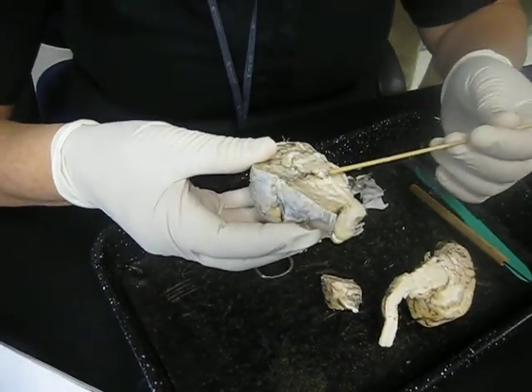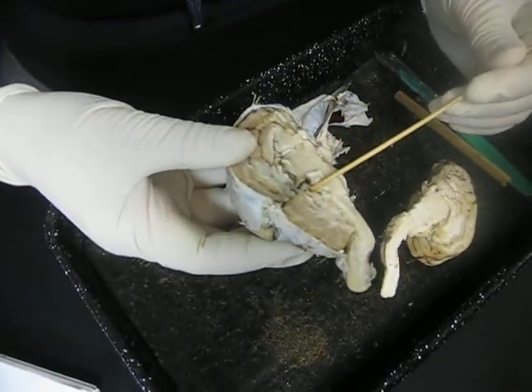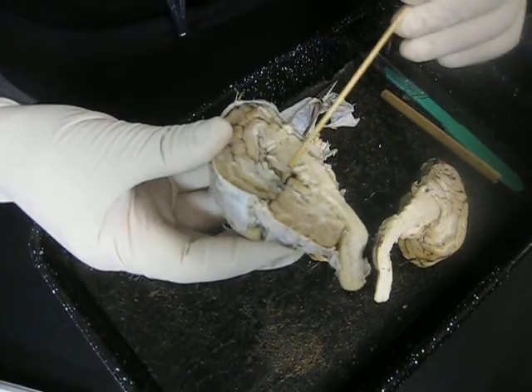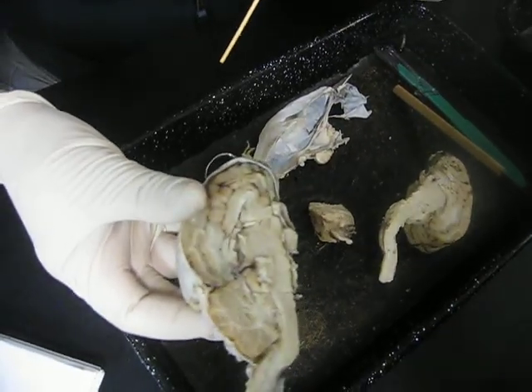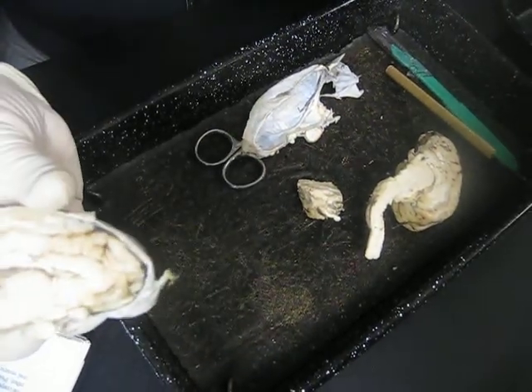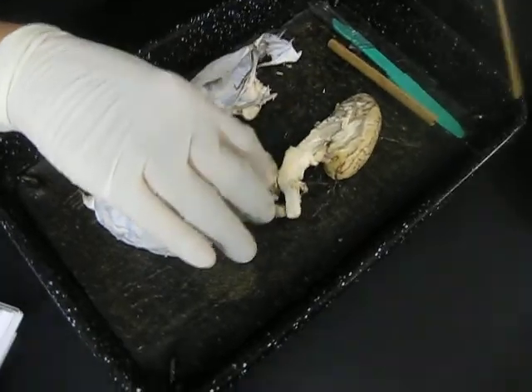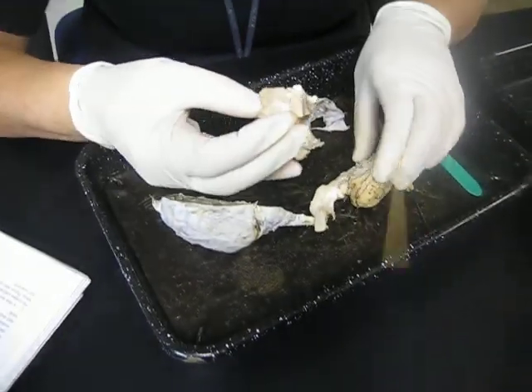I don't think so. Okay. Next to the corpora quadrigemina, and you have the two halves here. You have the superior colliculus and the inferior colliculus. Do you see that little round body in there? That's the pineal gland. Okay? Pineal gland. Okay. Any questions? You can take your mutilated brain.